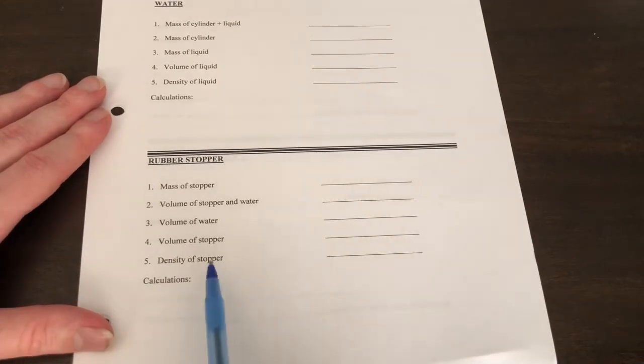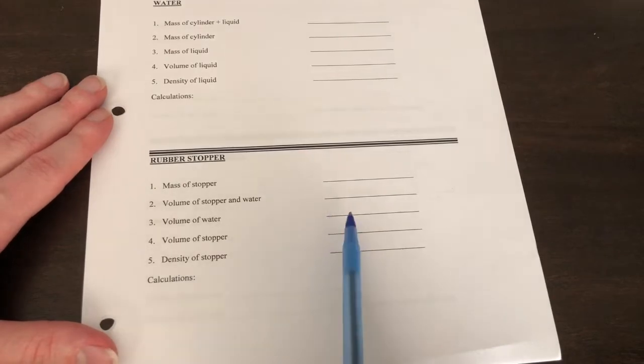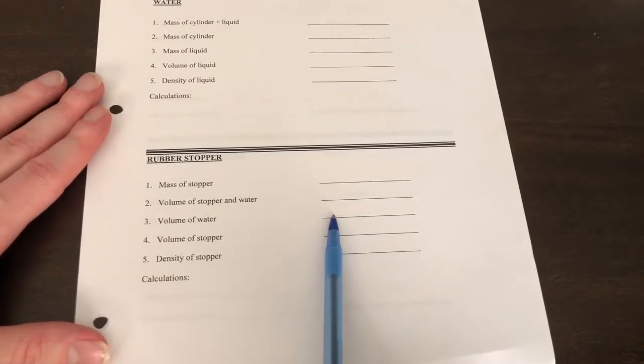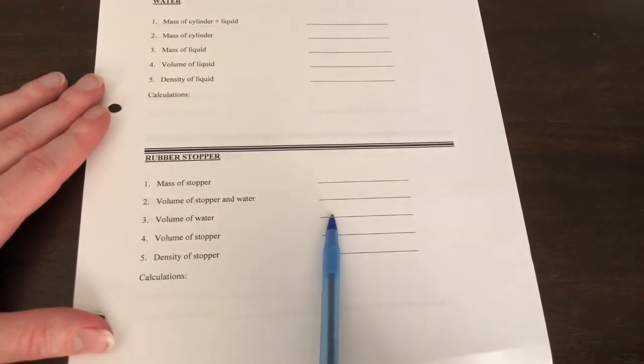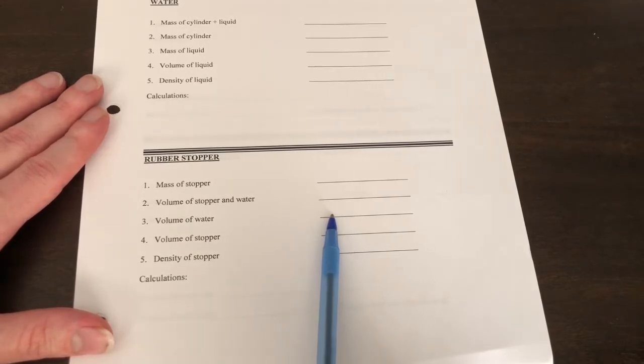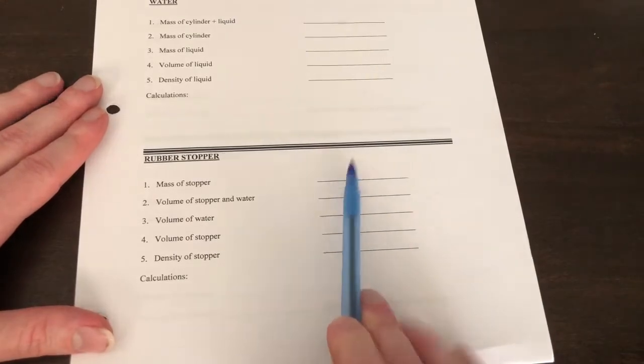Okay. The volume of the stopper is found by subtracting these two calculations right here, number 2 minus number 3. That's water displacement, and we talked about that in lecture, okay? The volume of the stopper is how much the water is going to go up, okay? And so the density of the stopper is going to be the mass of the stopper over the volume of the stopper.